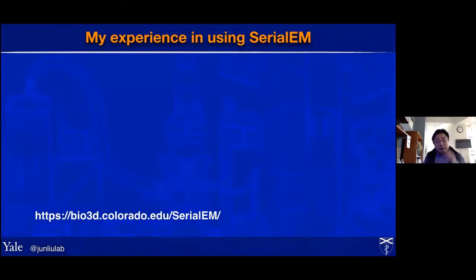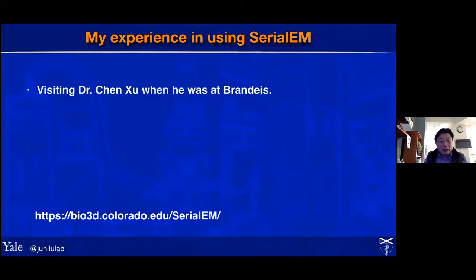Before I start to show the demo, I want to tell you a little bit about my experience. I hope this is valuable. First, obviously, there are so many packages available. If you decide to learn SerialEM, there's a really nice website that shows you how to do it. But more important for me, I visited Brandeis many years ago, just watching Chen Xu collect data using SerialEM. That's what I'm hoping to provide you today, to show how I collect data, so you at least get a practical sense of how to collect data.